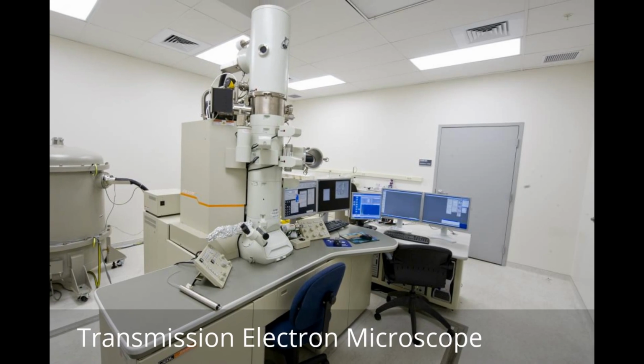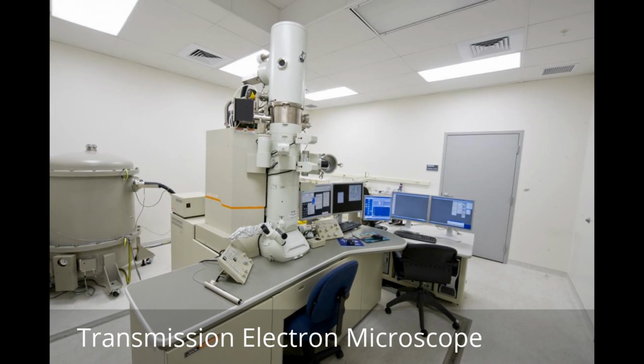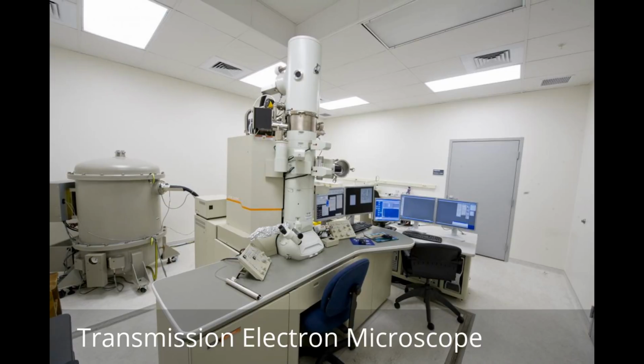Now, in electron microscopy, they view samples on a really powerful microscope, an electron microscope, and it's huge. Okay, it's huge. It's like a cockpit, and it's got this big column. There are actually two types of electron microscopes. There's the TEM, which stands for transmission electron microscope, and that one kind of sees through samples.